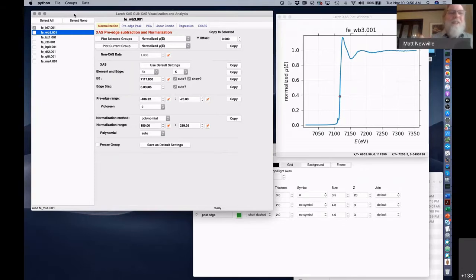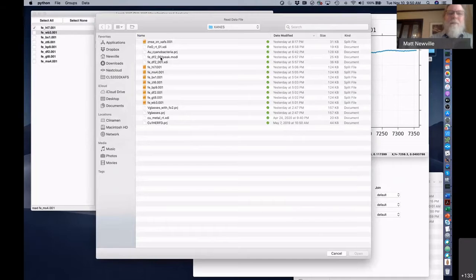So I guess I should take another step back. For what this program can read in right now, it's pretty much reading in most text files. I have samples from lots of beamlines, but it can't read in everything. And in fact, especially in this day and age of using Python and fast detectors, you might want to read in data from other sources, like HDF5 files that get streamed by your data set, or a MongoDB database or a Postgres database or something. You may want to get data from something other than an ASCII text data file. So Python can do that, and these tools can be used to do that.